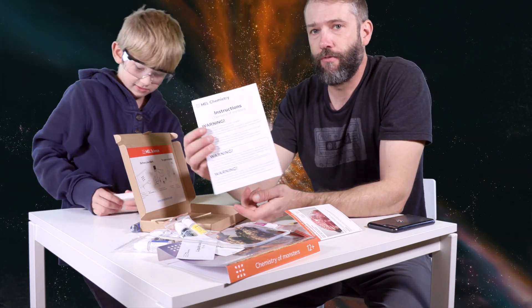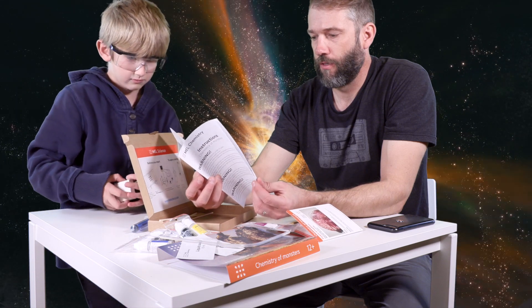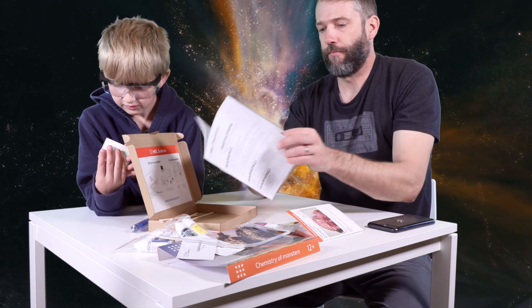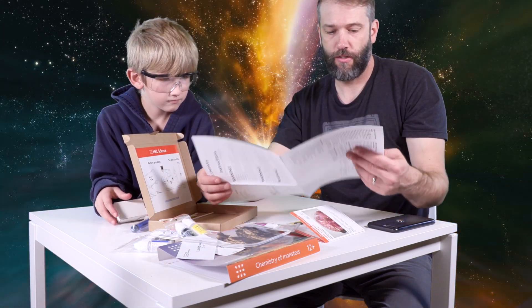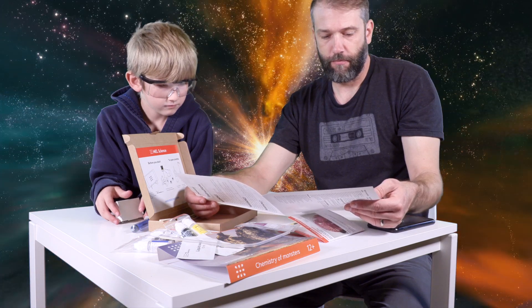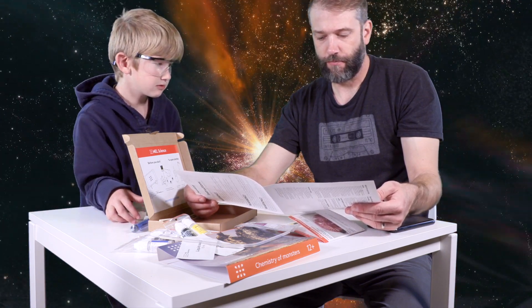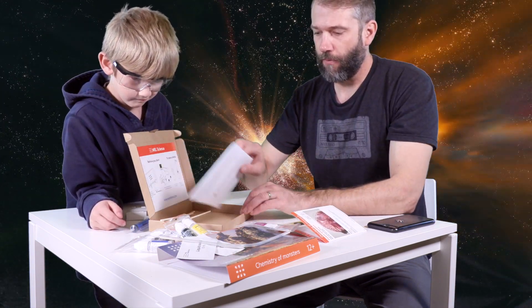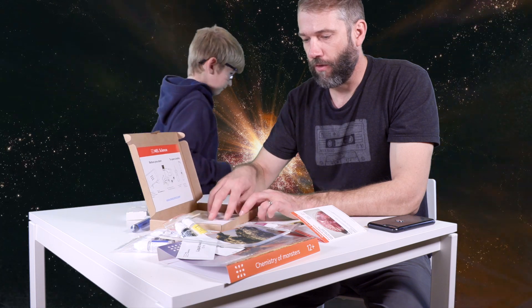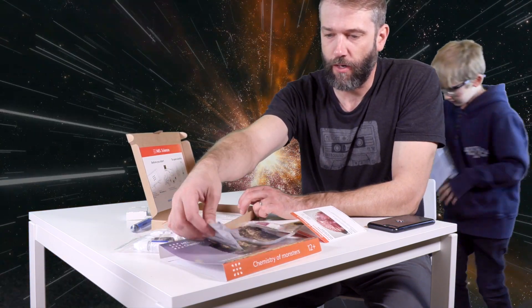As well as full instructions for Chemistry of Monsters. Inside the instruction booklet is another good set of instructions that goes through the whole thing. Let's put this stuff back and we'll show you the other kit. Open them up and get started on one of the projects.